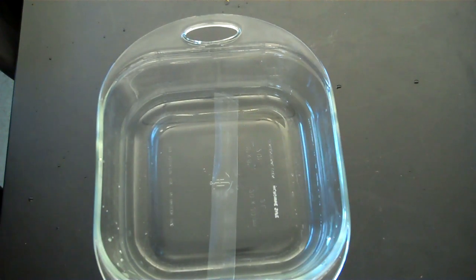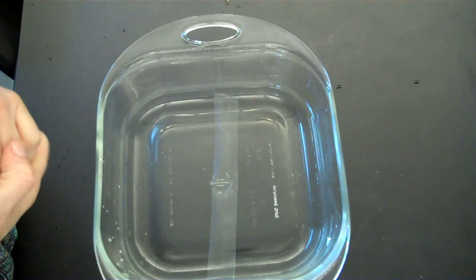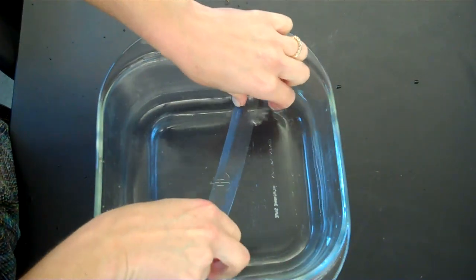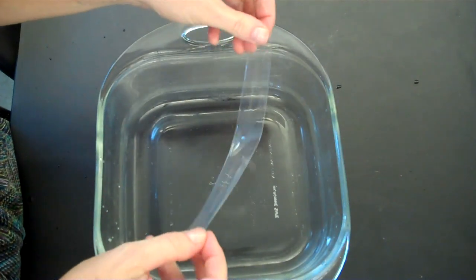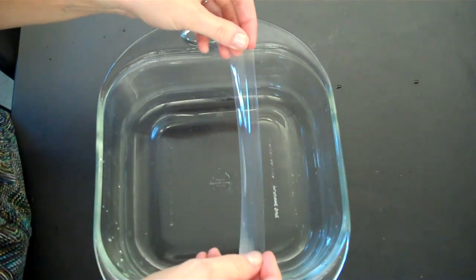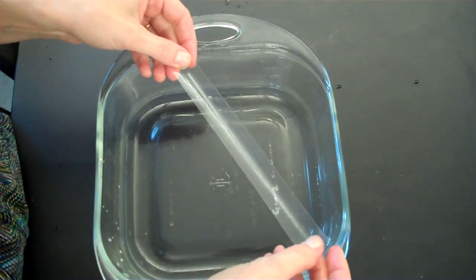In this segment, I'll be demonstrating how to use dialysis tubing to make a dialysis bag. Our dialysis tubing, when you find it, will be soaked in water, and this is to hydrate the tubing. So once you take it out of the water, it'll start to dehydrate. So please use it and form the bag shortly after taking it out of the liquid.